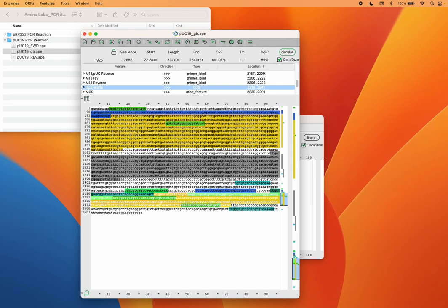And there are lots of different software that'll help you to do this. You could search in a search engine primer designer and find something. I think Ape is really good. It's got a very simple way to do it that works most of the time. And I'm going to show you how to do that.